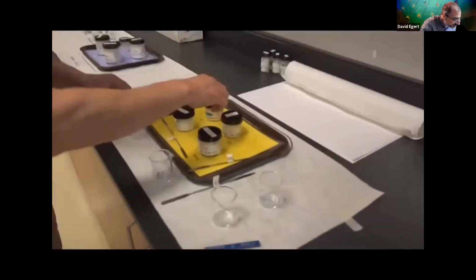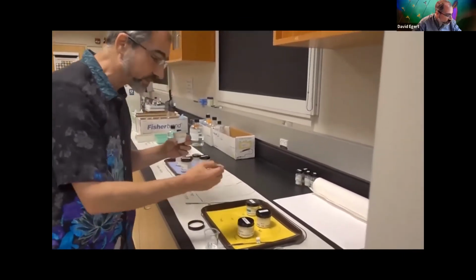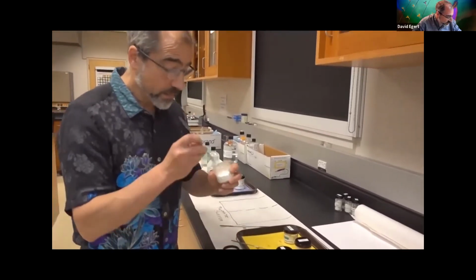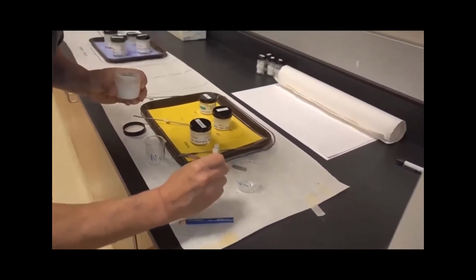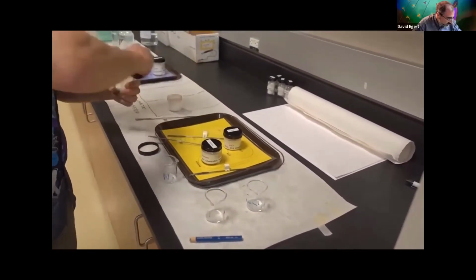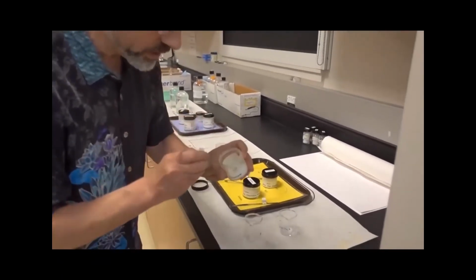So I'm going to put all of these in, and then our camera will come and look at this a little more closely. I've got my calcium chloride, I get a little pinch, and I'm going to put that in that one. And I'm going to get my sodium chloride and put that in here.